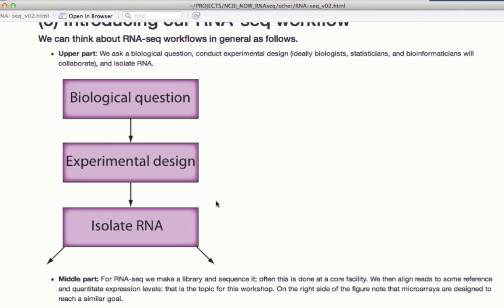For example, many people think that 3 is a reasonable sample size for each group. Others suggest 5, 10, or even more samples. Of course, cost may be limiting. Another thing to remember is, if you have control and experimental samples, be sure not to process the RNA for the controls on a Monday and the experimental on a Tuesday. Why is that a problem? It's called a perfect confound. It means that any differences you see could be due to date, rather than the comparison of control and experimental.